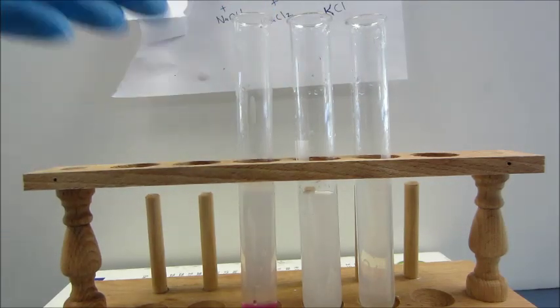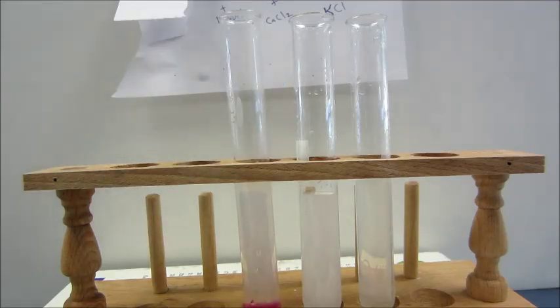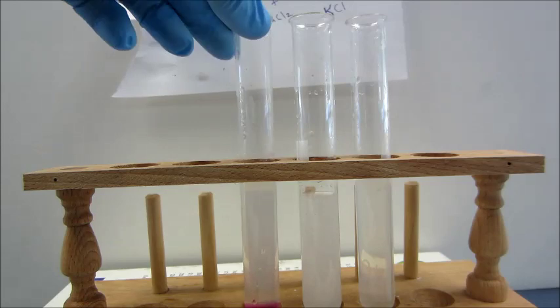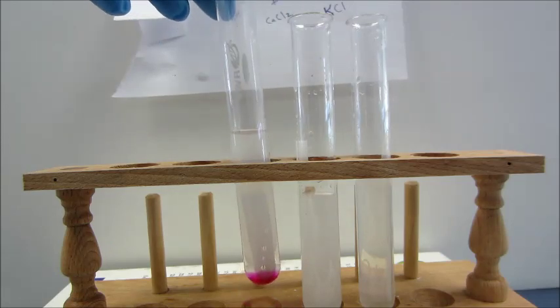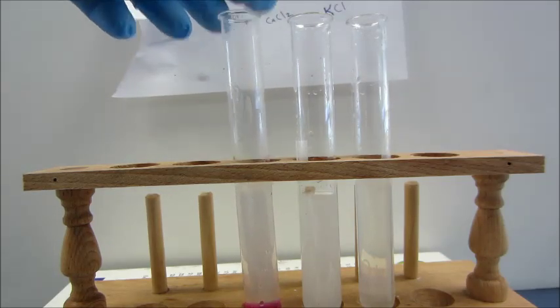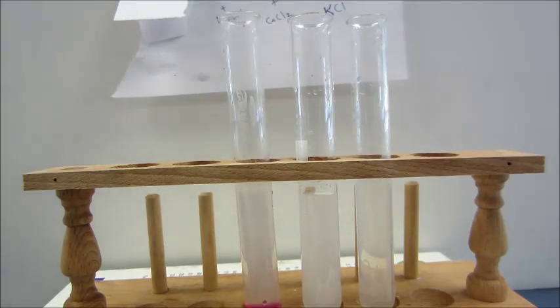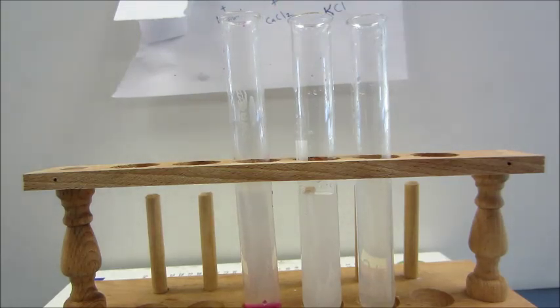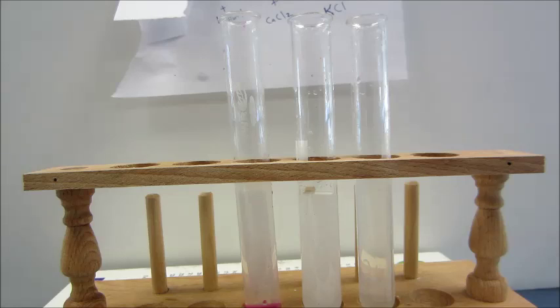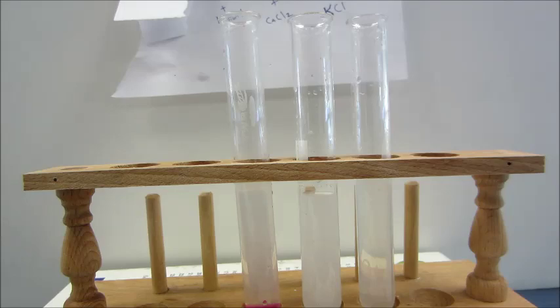This one actually did have a chemical reaction — even though we couldn't first see it, we had to use chemical means to detect it. With sodium hydroxide and hydrochloric acid, this is called a neutralization reaction — you'll learn about it later. Basically, you take a base and an acid together and you get mostly water, and all water if you do it perfectly, plus some other compound — in this case, salt: sodium chloride.